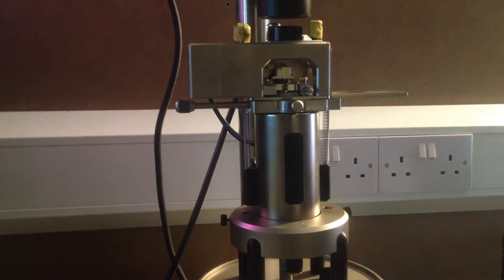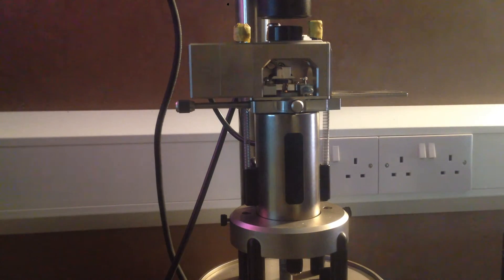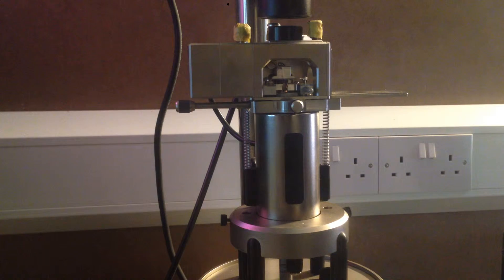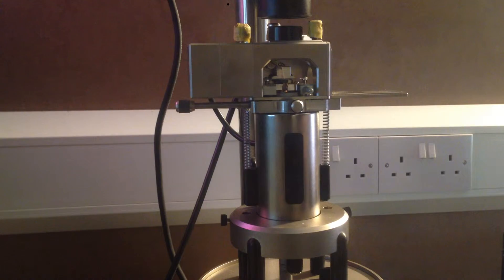Maybe if you put something reflective down there it's easier, because generally I can't see the spot, which makes it a lot more difficult. But if it's reflecting off a sample, that helps you see.